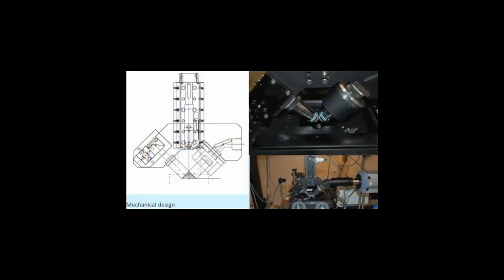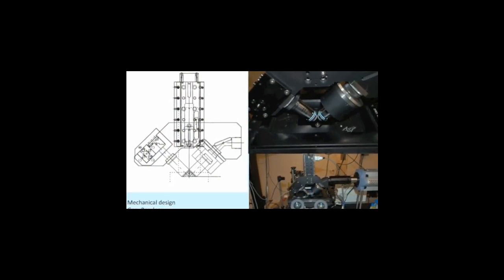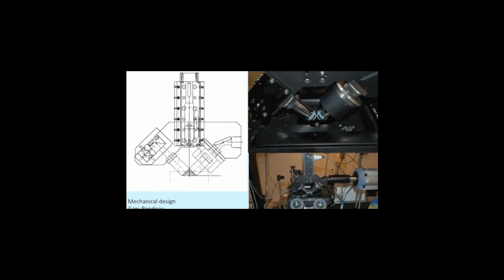This technology is called inverted selective plane illumination microscopy and is 30 times faster than the fastest microscopes that are conventionally used in the field.